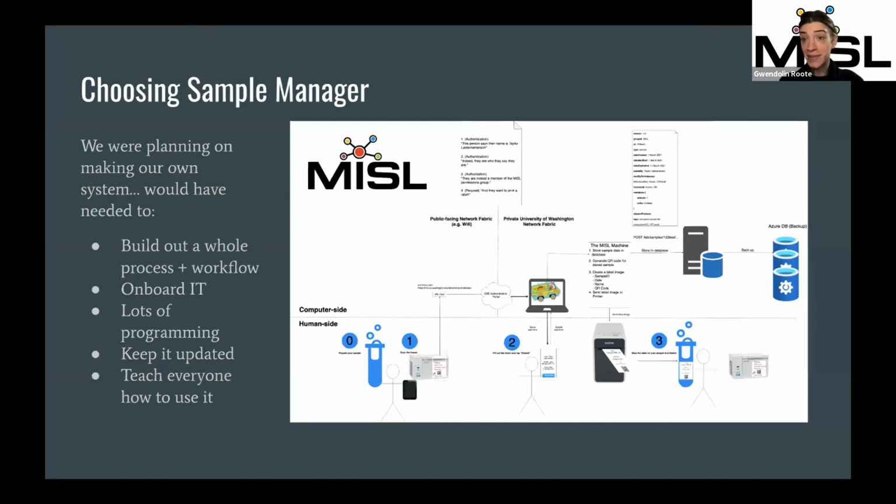So when I came to MISL and David, our previous lab manager, said, we're going to make our own sample management LIMS, I thought, that's going to be my job, because, as you all know, it kind of takes a whole team to make something as amazing as this. So he had a plan for building out a workflow, a process, getting UW-IT involved, programming the whole thing, keeping it updated, and educating all of our users for it.